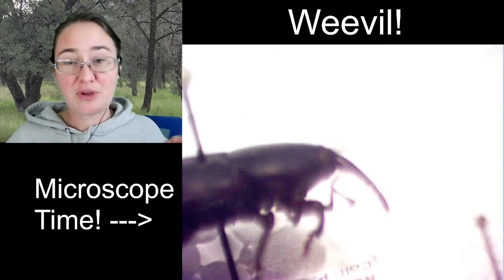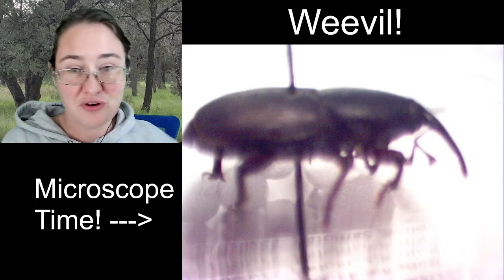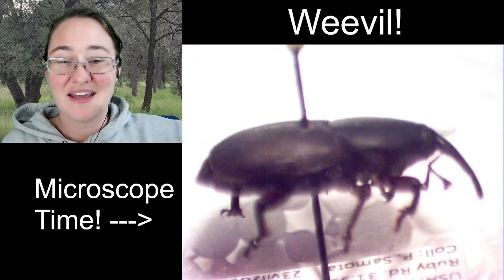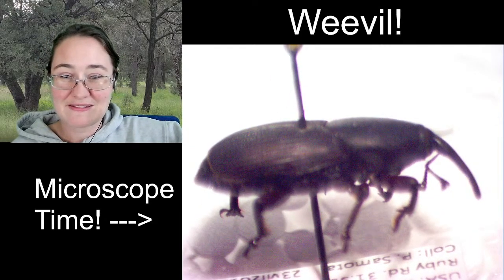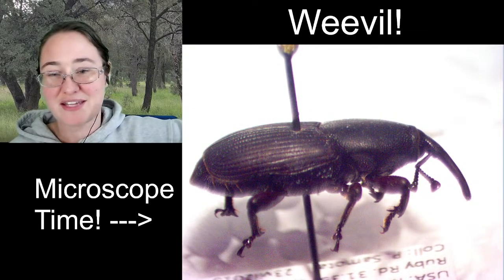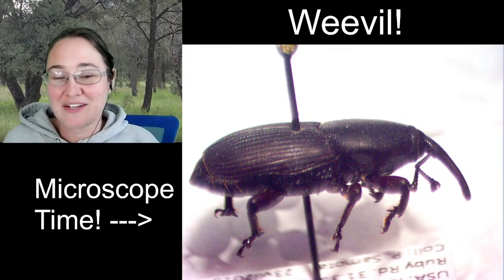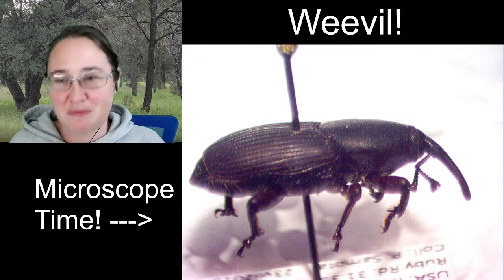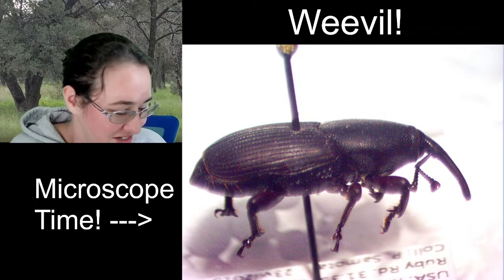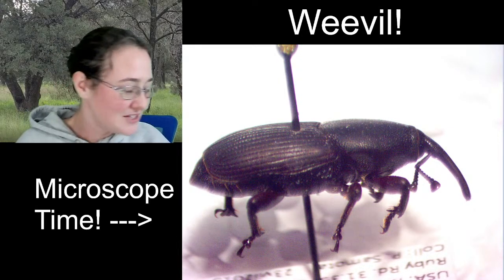Alright. Which of the three weevils do we want to sketch? The first one, the second one, or the third one? And it looks like Susan, what do you think? Do you like this black one? I think he's got the best proportions. I think we've drawn this one before, but I like him because we can see all of the parts really easily. I won't have to flip it in a bunch of directions to see the snout and the legs and stuff. Let's do this one.